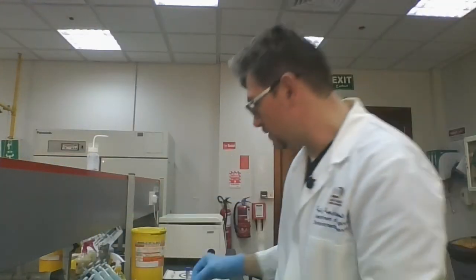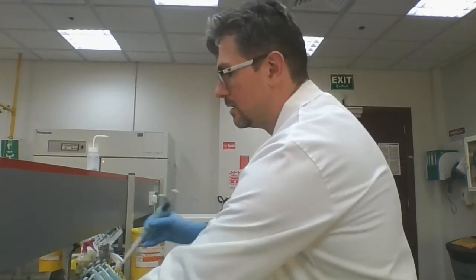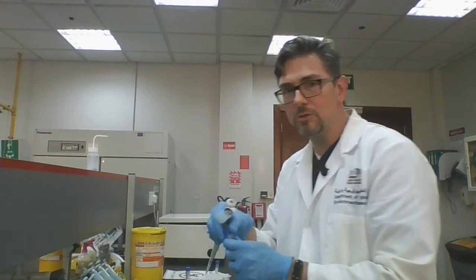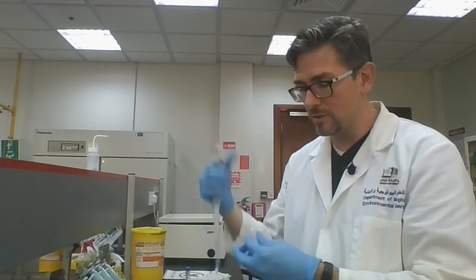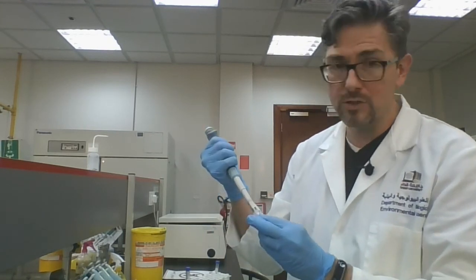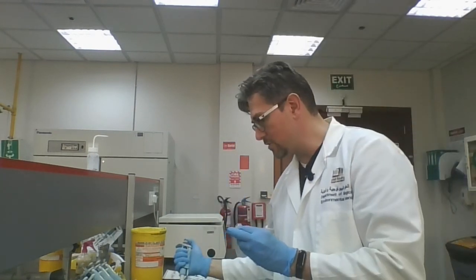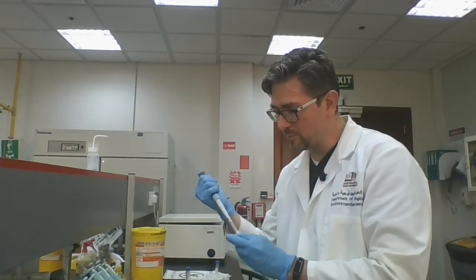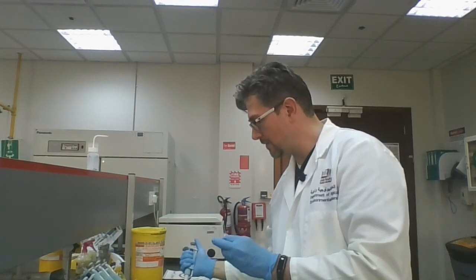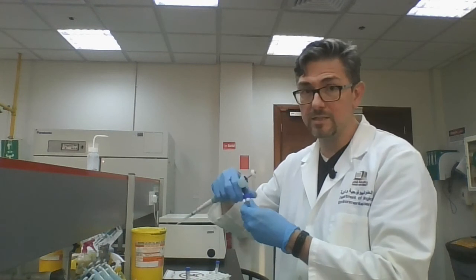We're going to wash it with some ethanol. So we're going to add a milliliter of 70% ethanol to this. Now, depending on the protocol, you might see people doing the wash two or three times. We're just going to do it once. Just add 1 milliliter. The actual volume doesn't really matter as long as you're consistent. You could use half a milliliter if you want. You just add 1 milliliter of 70% ethanol to each of the tubes. Make sure you're pipetting accurately so that you have the tubes balanced at the end.